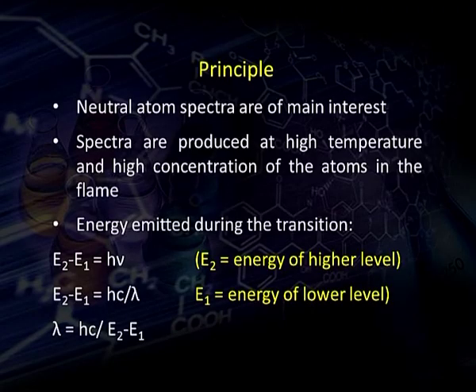The neutral atom spectra are of main interest in flame photometry. Spectra are produced at high temperature and high concentration of the atoms in the flame. That means, we have to provide high concentration of the atoms in the flame to obtain a proper spectra.